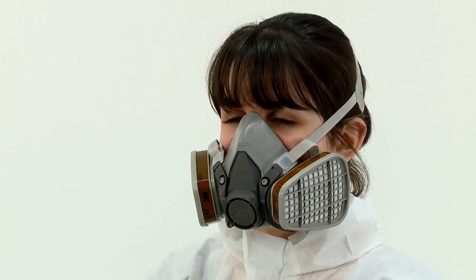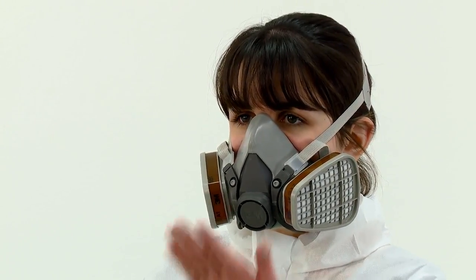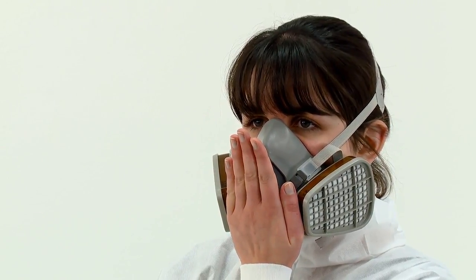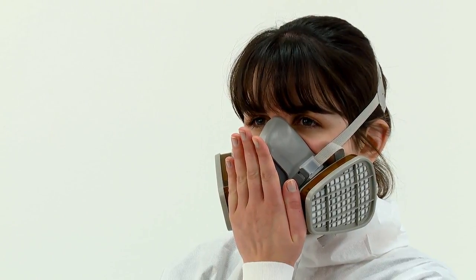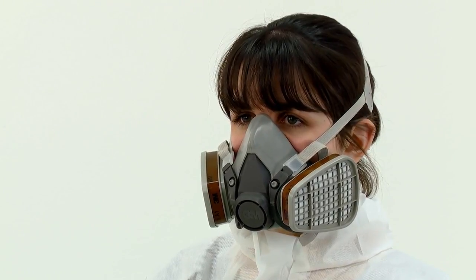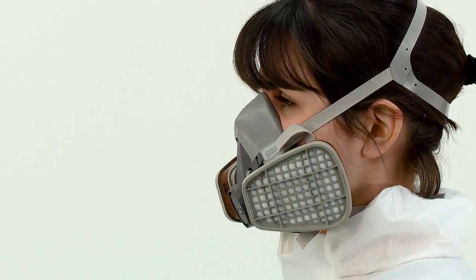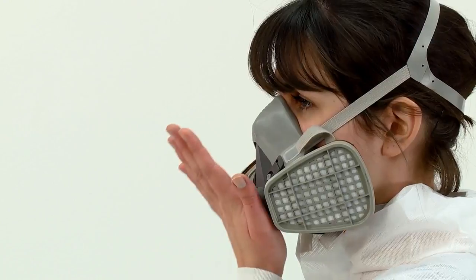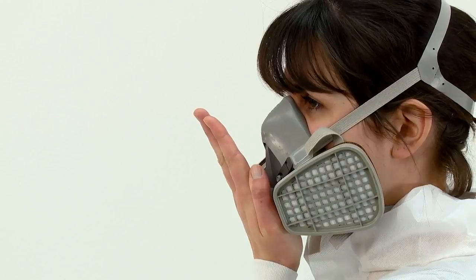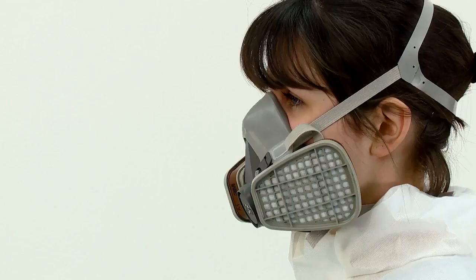If gas and vapour filters or combination filters have been fitted, a positive pressure fit check is performed by placing the palm of your hand over the exhalation valve cover, being careful not to disturb the fit of the respirator. You should then exhale gently. If the face piece bulges slightly and no air leaks are detected between the face and face piece, a proper seal has been obtained. If it does not and you detect air leaks at the seal, adjust the fit, taking extra care with the tension adjustment of the straps, then repeat the fit check. If you cannot achieve a proper fit, inform your supervisor and do not enter the hazardous area.